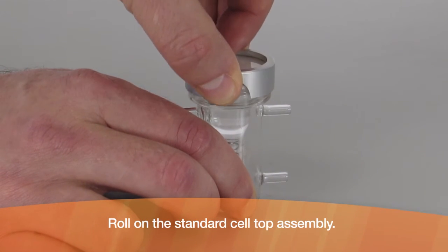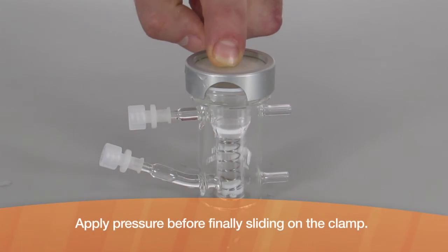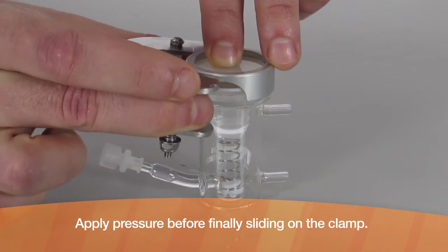Roll on the standard cell top assembly and apply pressure before finally sliding on the clamp.